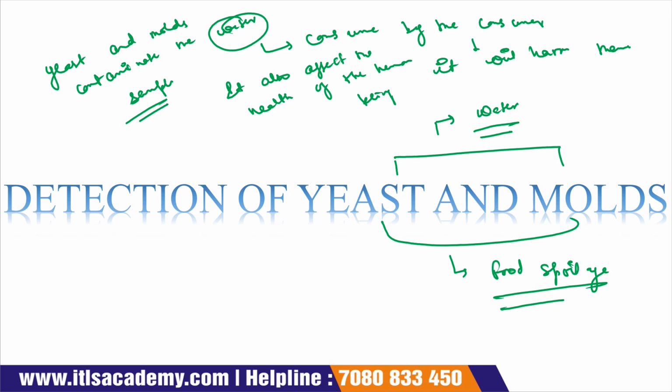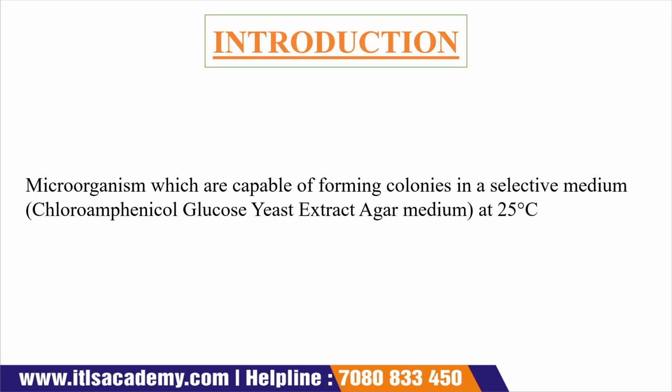We all know that yeast and mold come under the category of microorganisms. That means that we cannot see them with our naked eye. That's why tests are performed for their detection. So let's start today's lecture.